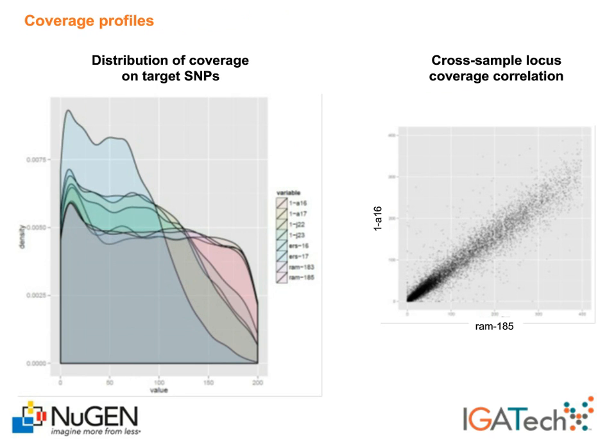To assess the cost effectiveness of the enrichment and the sequencing, we analyzed the distribution of coverages on target SNP sites. Distributions are kind of wide, as you can see in the left box. This is also expected in a single primer extension method, where small differences in the annealing efficiency can have a dramatic impact on the final amplification product. Since most SNP sites reside below the threshold of 200x coverage, we did not report over-amplification issues caused by repetitive regions or such.